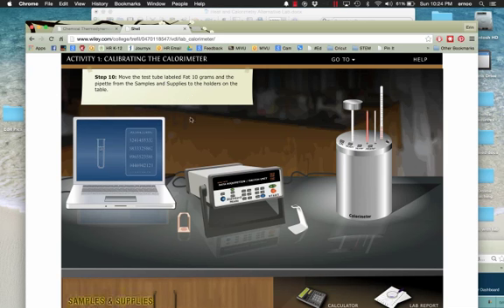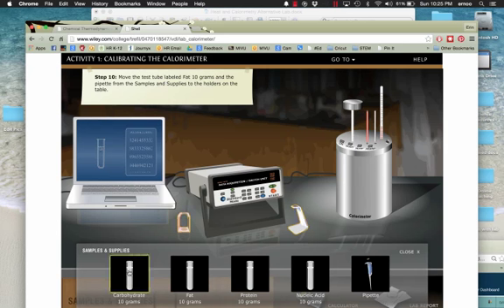So, did I do this on this computer? I do not think so. Okay, so we need to go here, and we'll do carbohydrates. Put that there. Oh. Put that there. Oh, why won't this let me do it? Try the pipette. And did we already do our carbohydrates? We must have done our carbohydrates. So we'll try our fat then.